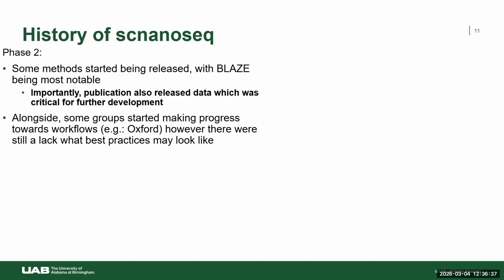Now, at that time, we saw some groups, including Oxford. I think at that time it was primarily Oxford and Nanopore, not so many other third-party groups, put some effort into trying to develop their own workflows. But these were still early days. So here at UAB, or at UBDS, the road was still unclear of how this would look in the next few years.